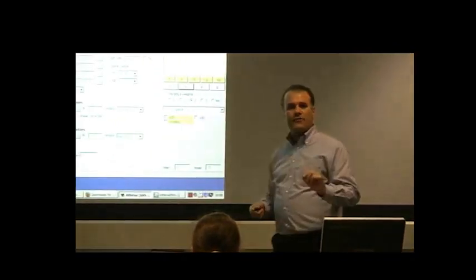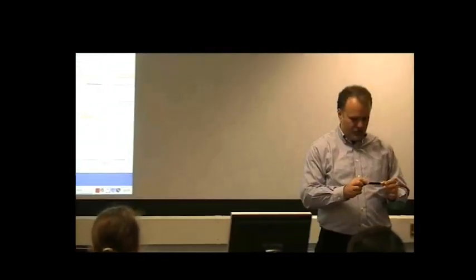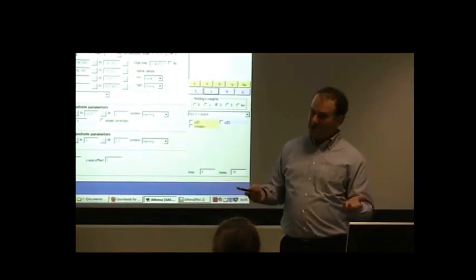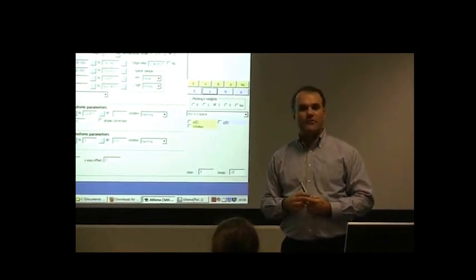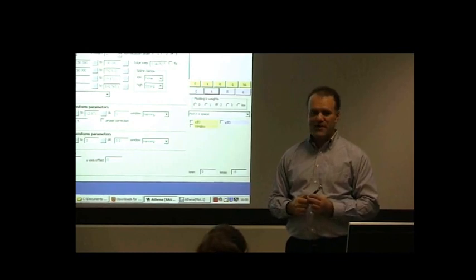Now, those of you who are lucky enough to do your experiments at beamlines that are some decades more modern than my beamline have much better functioning monochromators than I have. One of the nifty advancements in the last 20 or 25 years is that these things come with encoders.